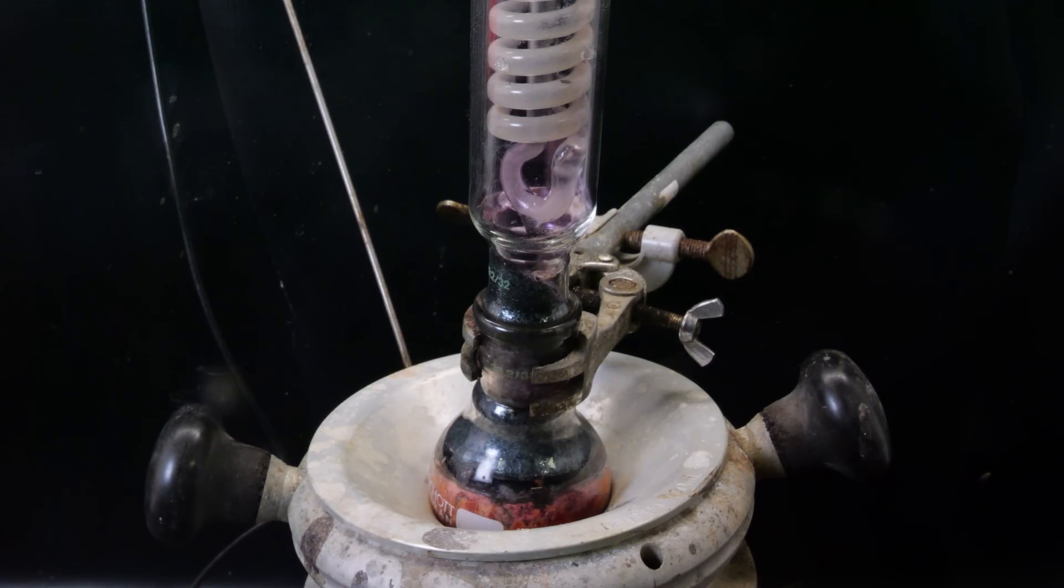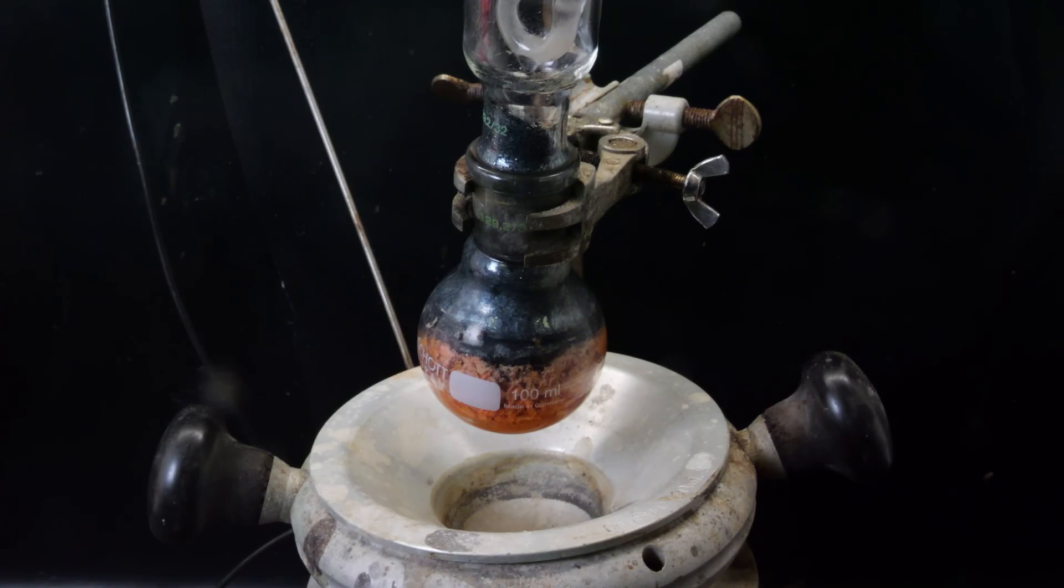When I return the next day, a bunch of orange solid can be seen. That should be the product. And the excess iodine has sublimed towards the top of the flask and into the condenser.